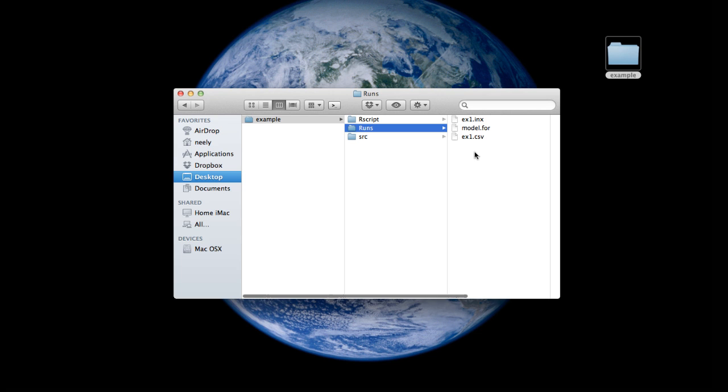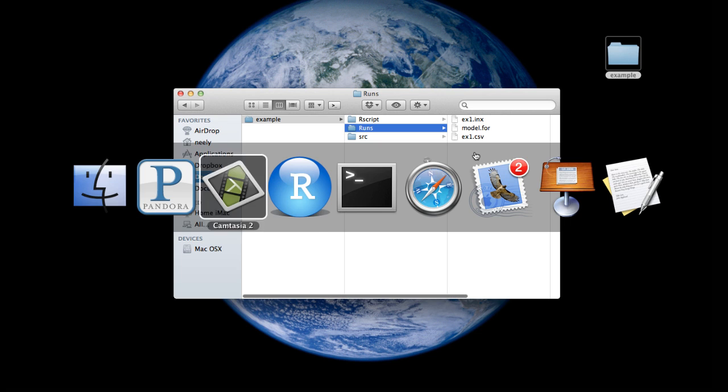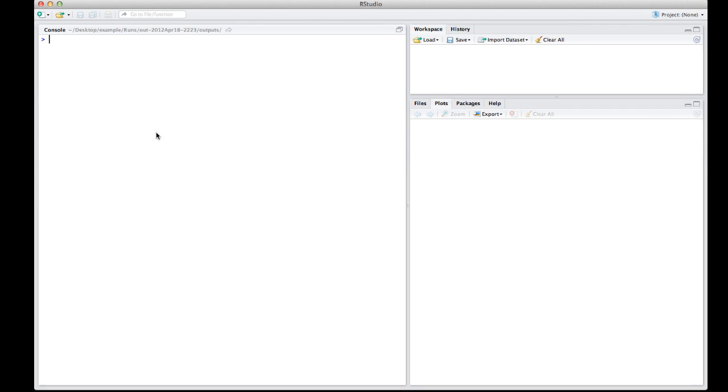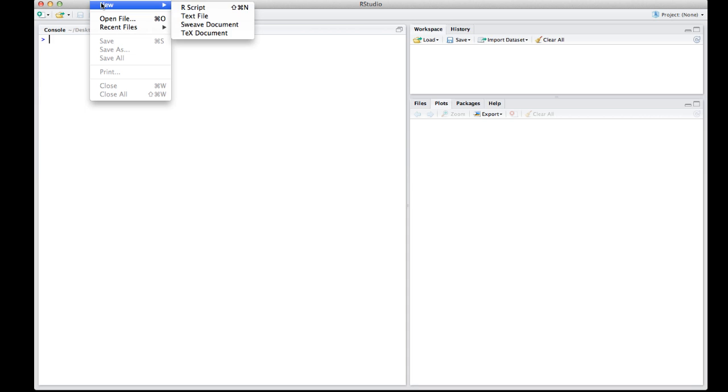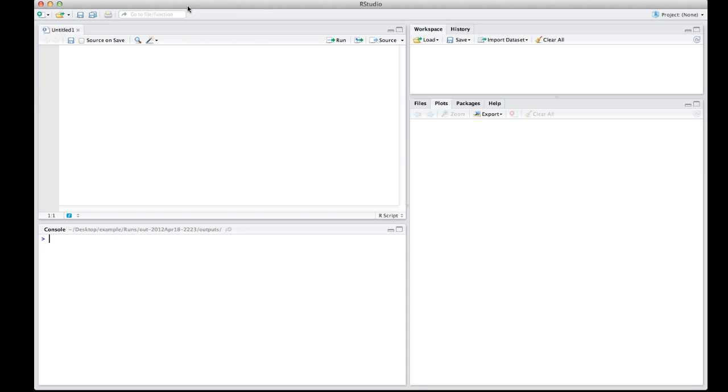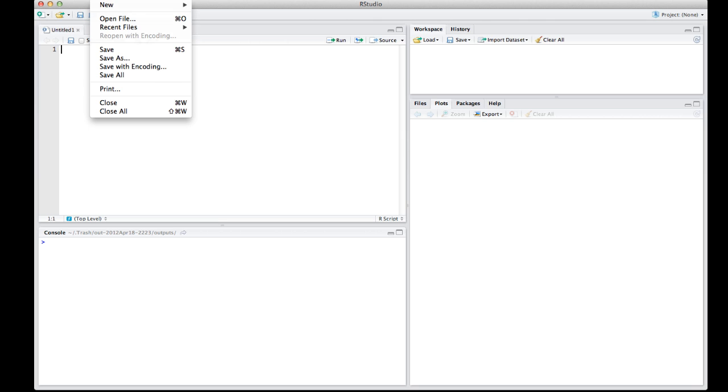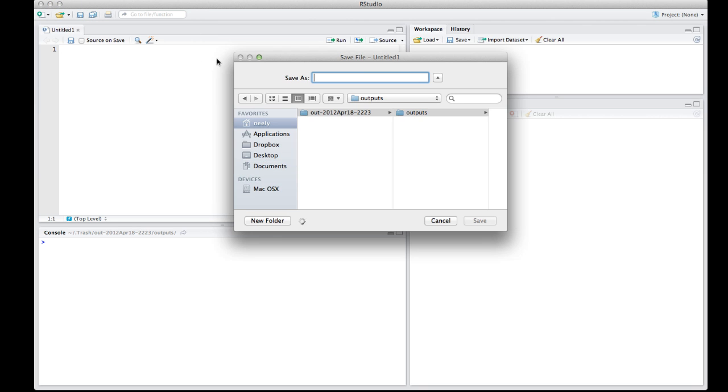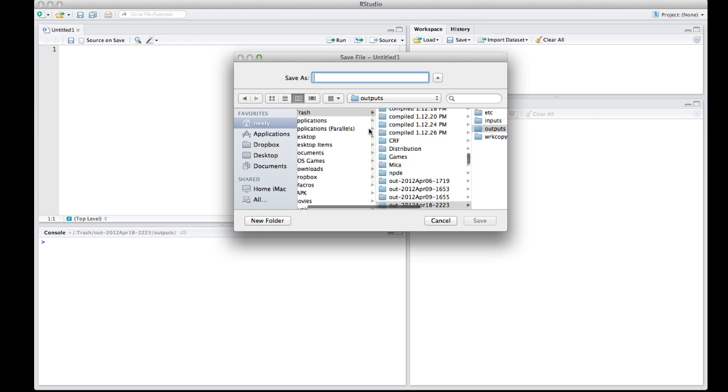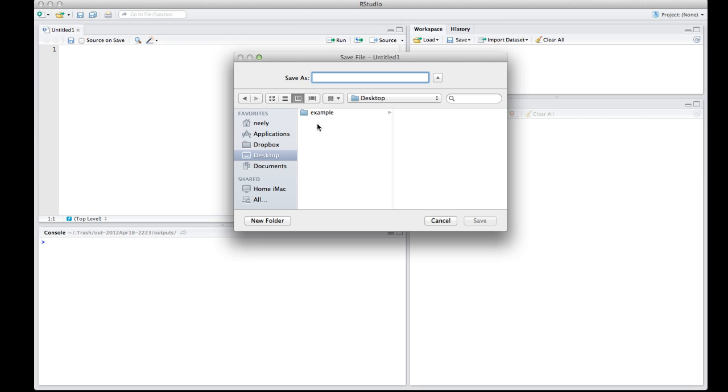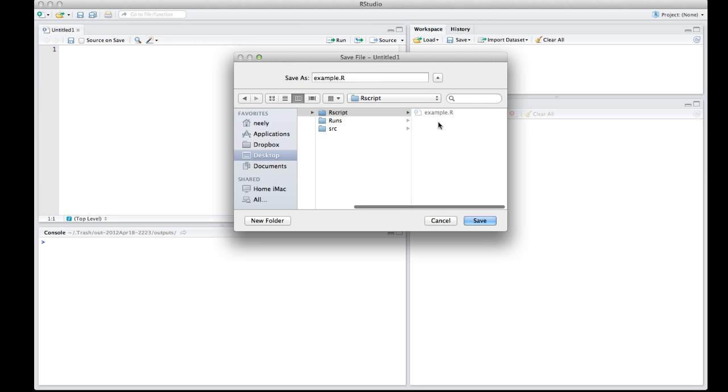Now that we have set up our working directory and put the files into the working directory that we need to run PMetrics, I'm going to launch RStudio. And I have a blank console, so the first thing that I need to do is to make a new R script. And generally, before I go any further, I save it in my R script folder.